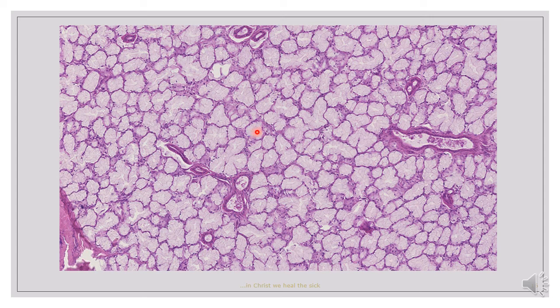The clumsy appearance shows the presence of mucus cells and their cytoplasm. For the sublingual gland, you can see from this slide that it does not appear as prominently lobulated as the parotid gland. The ducts of the gland are most times seen in the substance of the gland, and importantly, these ducts are stained much deeper than the gland — you can see how they are stained deep purple compared to the substance of the gland. One of the characteristics of the sublingual gland is that the duct stains more than the gland.